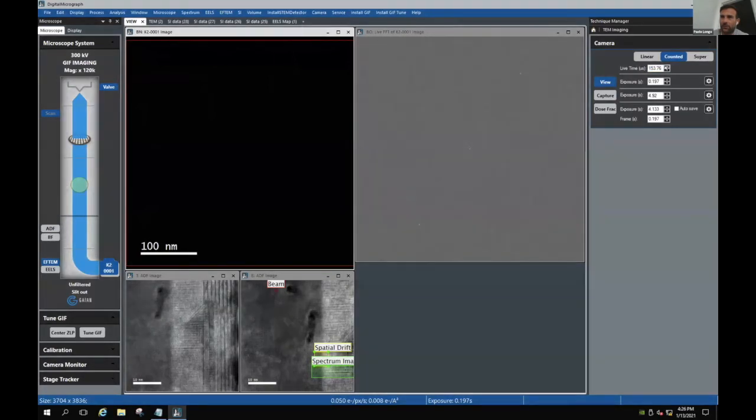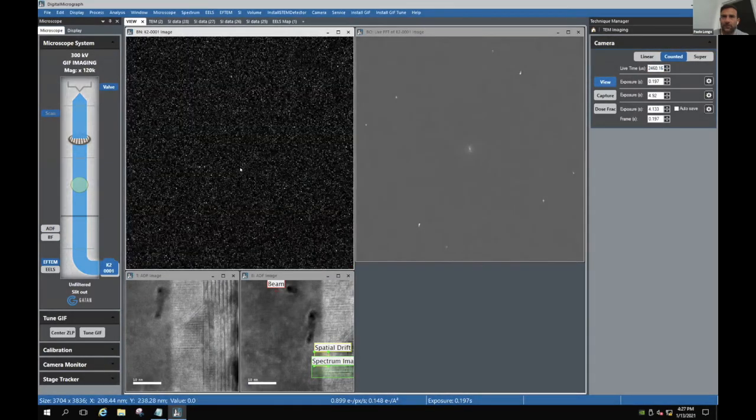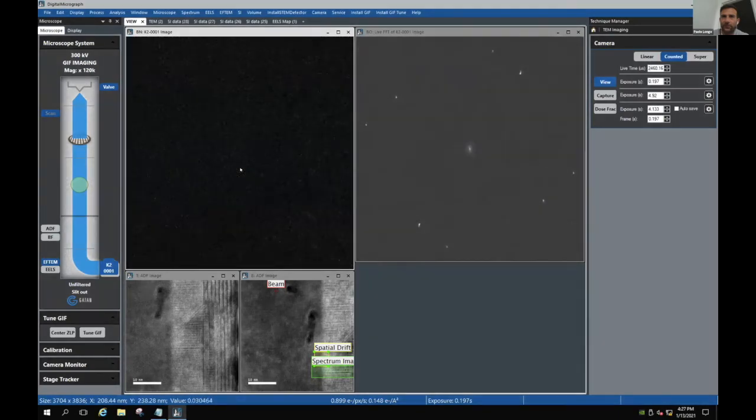Let me bump the dose. Robert, you don't have to do anything now. So I actually open up the shutter completely. Look at this. So now we actually start to see something there. So you see some electron sparse, and you're working at about 1 electron per pixel per second. This is the 0.1 electrons. But you already have some atomic information.